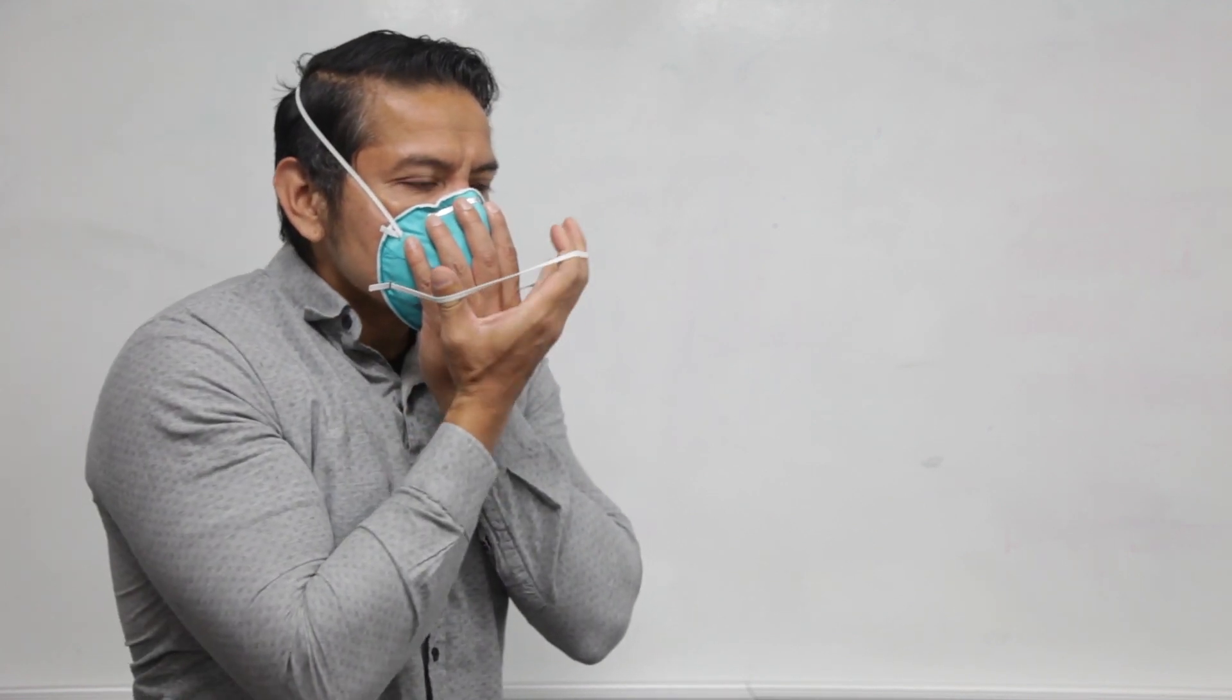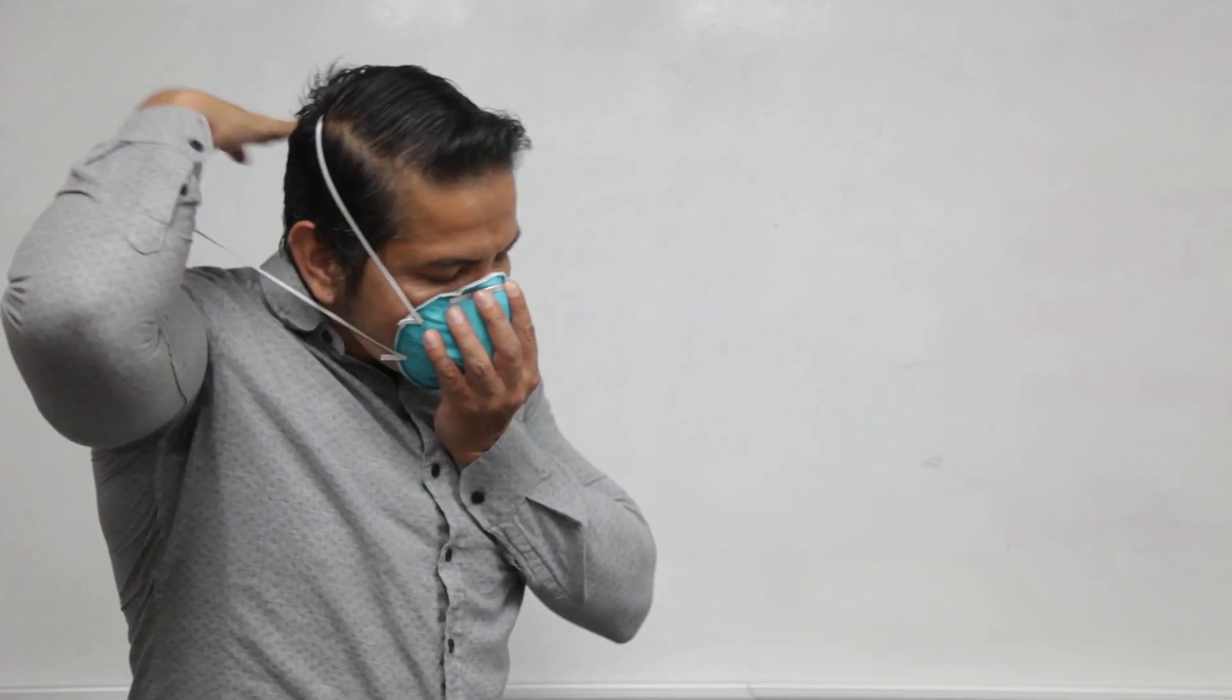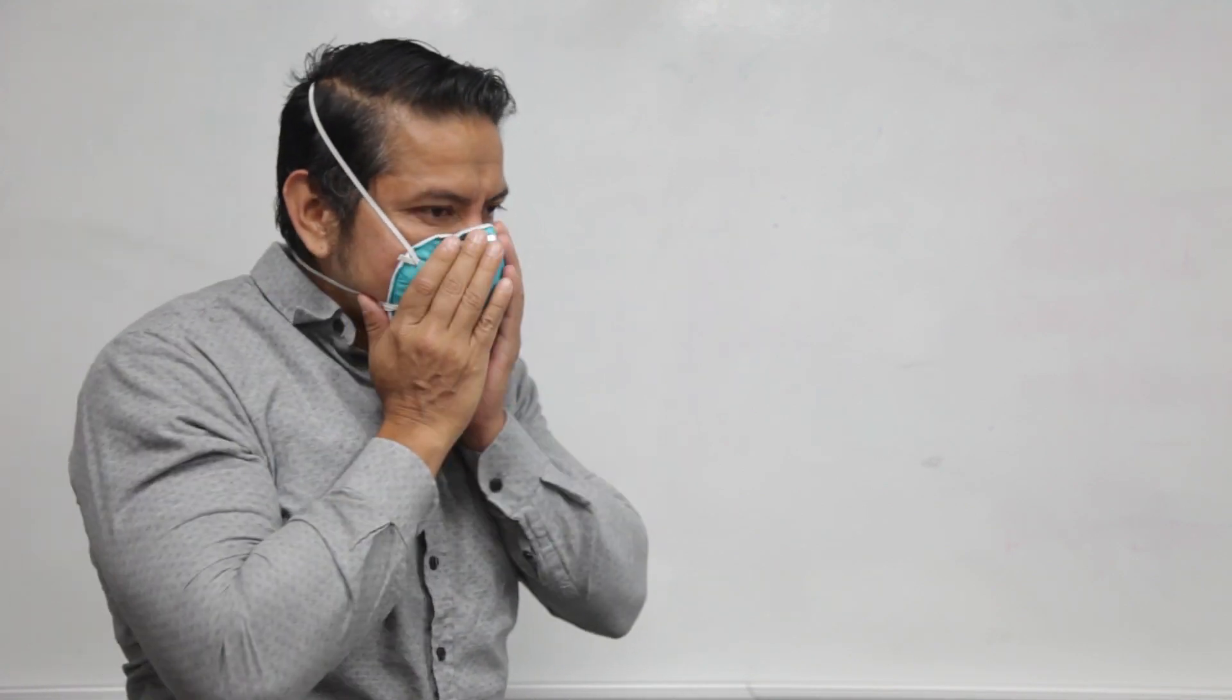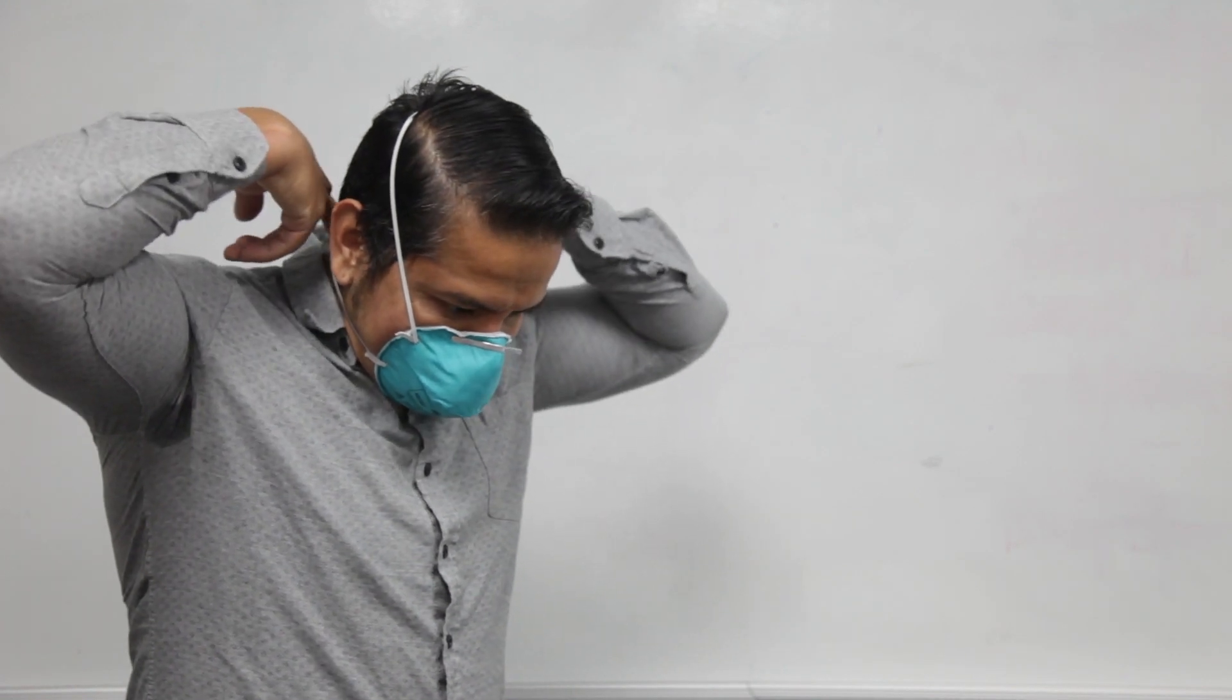Then, while continuing to hold the mask in position, pull the bottom headband over your head, resting it around your upper neck below the bottom of your ears.